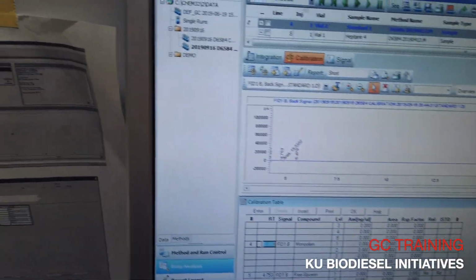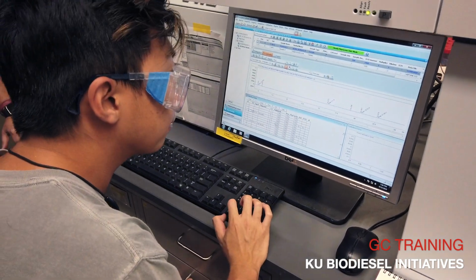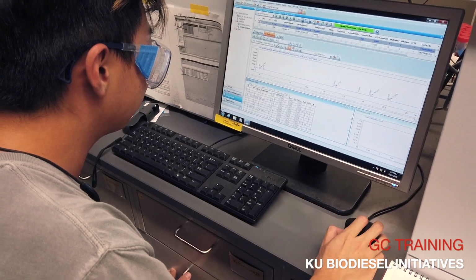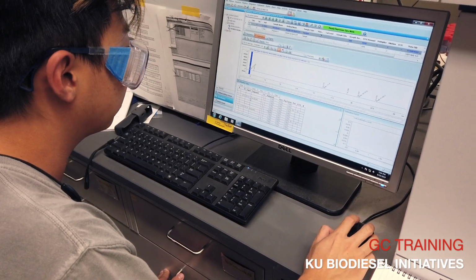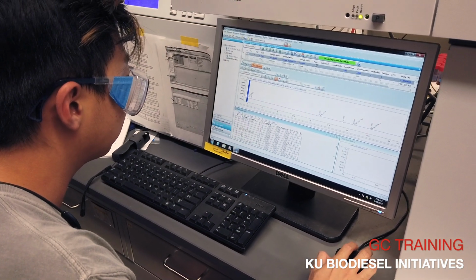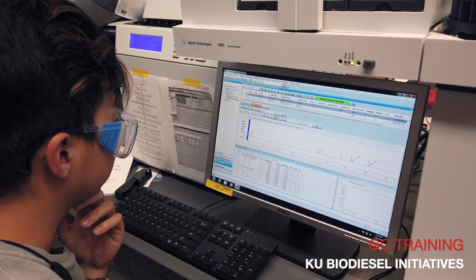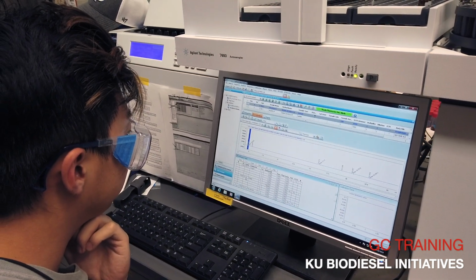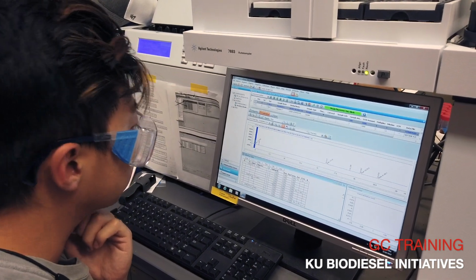Here, you guys can go ahead. I'm just gonna walk you through this. Are the numbers that he's putting in only for the first graph? Do we have to do them for all? No, this will update for all of them. This is just the calibration table of the method. You'll have two things: the method, which tells the GC how to do everything, and the sequence, which will have the specific data attributed to each sample. The only thing attributed to the sample is the chromatogram.